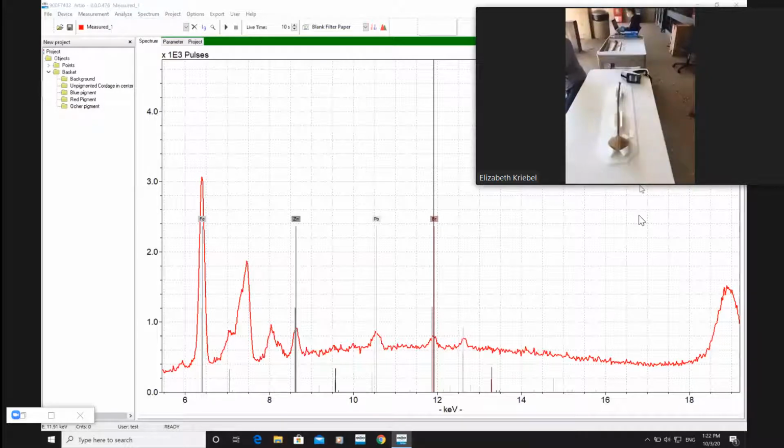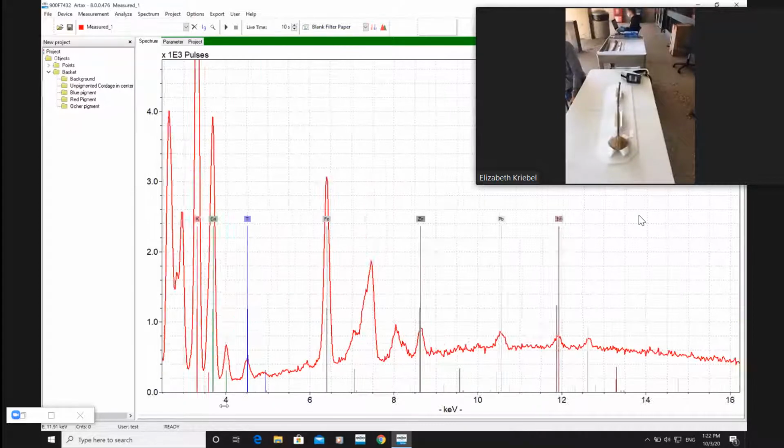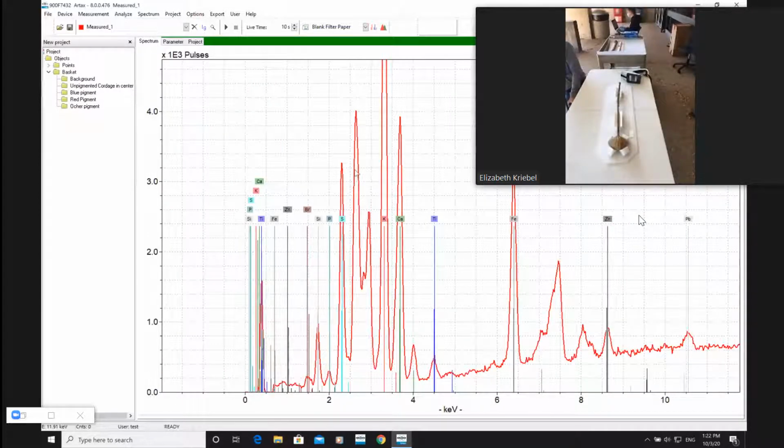Br, bromine. That's a halide. That's a salt. Oh. That is definitely put there on purpose. And it's put there on purpose because this thing is loaded in chlorine. Do you remember when I talked about potassium and rubidium, calcium and strontium? That's also true of chlorine and bromine. This is salt washed. So they tanned this with a salt solution, and that's how it's preserved. It's not toxic. It doesn't taste good, but it's not toxic. So yeah, this is not preserved in anything dangerous. We'll look at a couple of the other components, but this would be salt washed.